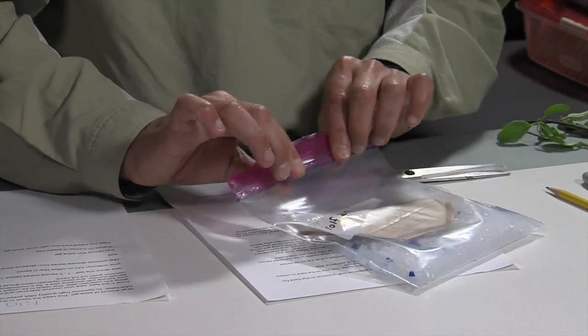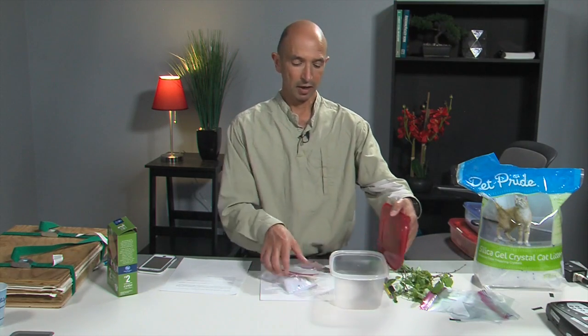Sometimes you'll get back an envelope with a few crystals of silica gel and then stuff with 20 leaves. That's not very good. You do not need more than a single leaf, a small leaf, a square inch, 5 to 10 square centimeters of most species of young leaf tissue to get a sufficient amount of DNA. So plenty of silica gel and not too much leaf. What I do then typically is from one sampling site, I will put all the bags together in one sealable plastic container, and sometimes I'll put a little bit of extra silica gel in there.